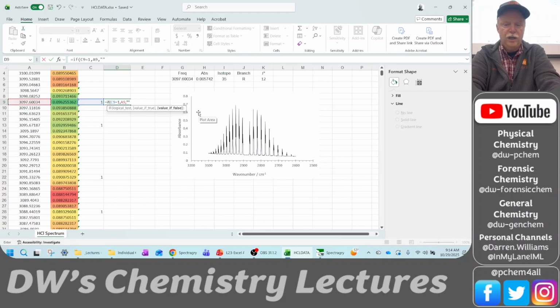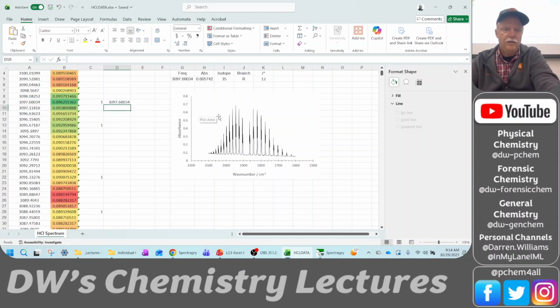Otherwise, just return nothing. So it's two quotes with nothing in the middle. So just return nothing. And so there's my peak. Now I also want to do the same thing for the absorbance value. So I'm going to look at that flag, and if the flag is 1, I'm also going to pull the absorbance value over there. So now I have the frequency and I have the intensity for each of my peaks.